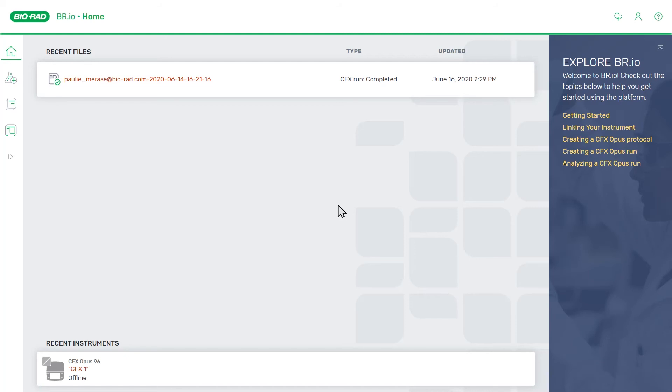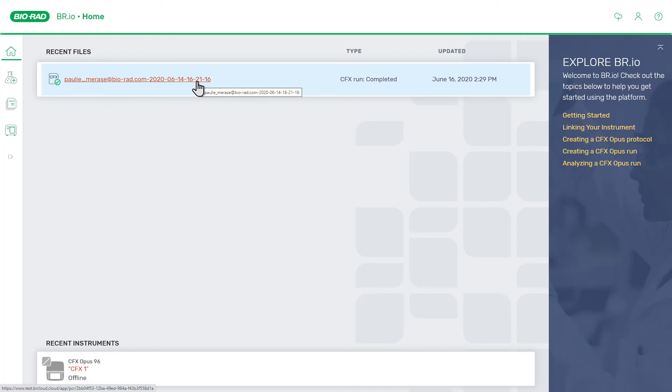Now that the run is completed, let's review and export the data that were collected. First, we will go to the files page, find the run, then click on the file name to open it.